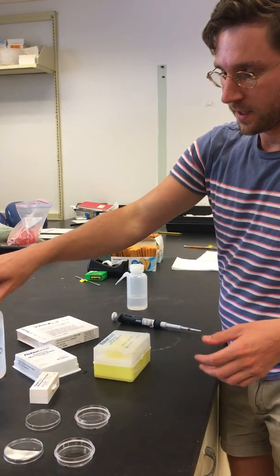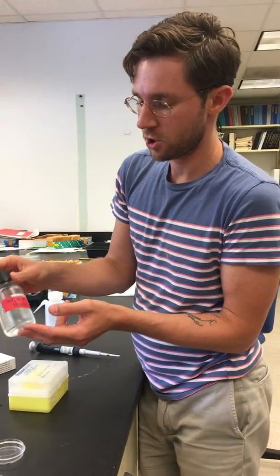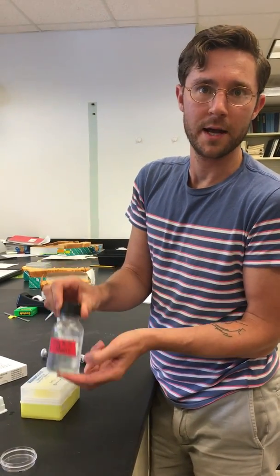Water and Brubaker quack solution - this is the medium in which pollen will germinate. It's sugar water with some ions in it.